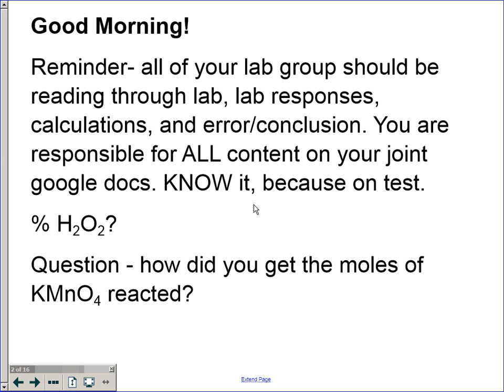If you're not one that has done, let's say, I know Christian's done this twice or 3 times now, heating of the crucible, right? And understanding when to stop the heating process. Those people are going to be phenomenal on questions regarding crucible heating because they've done it. But it doesn't mean that the rest of us are not responsible for that information.